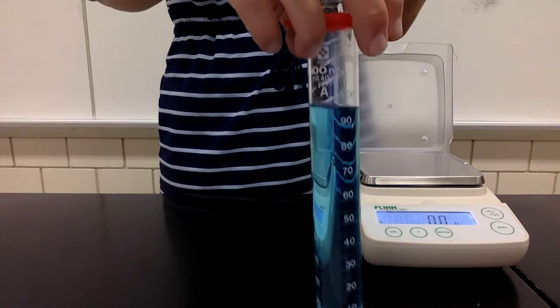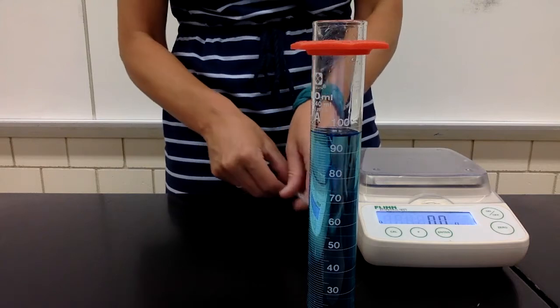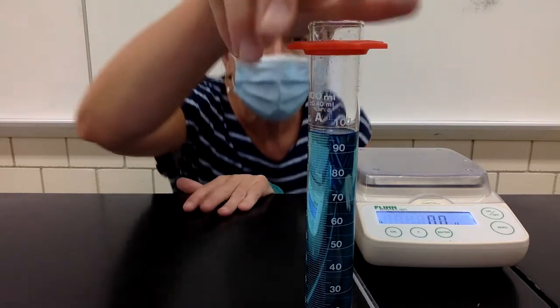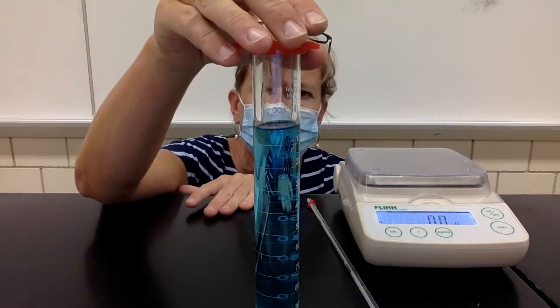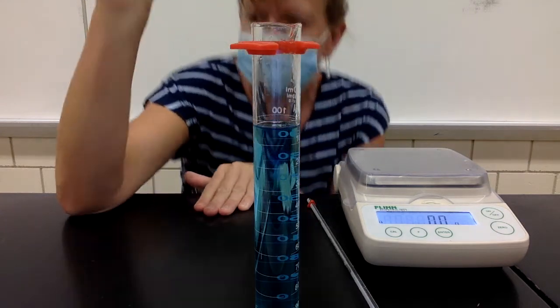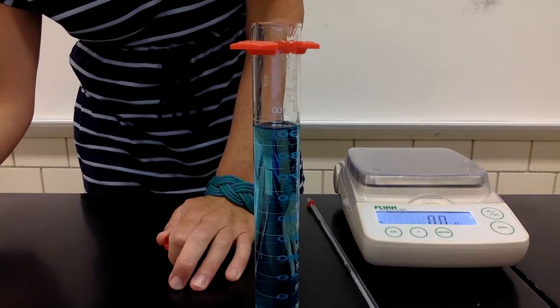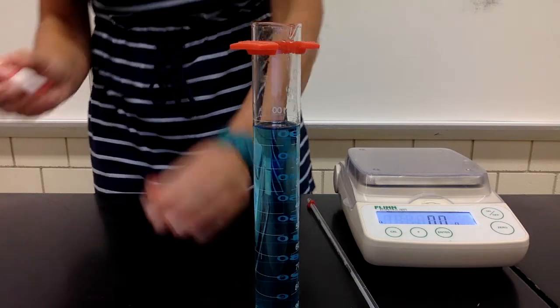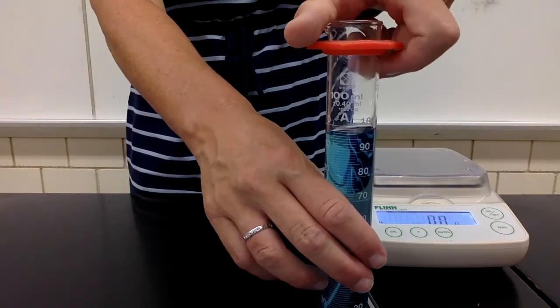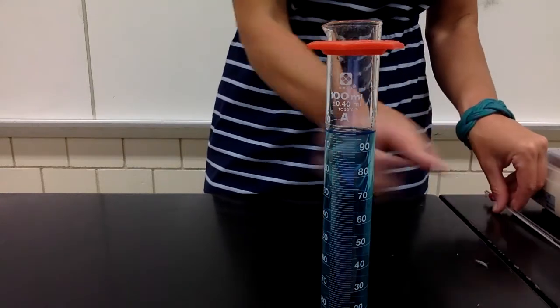And then I am going to measure the volume again, and that looks quite a bit different. If I read the volume now, wow, it looks like it's well below the 100 mark. It looks like it's about 96. So a significant drop in volume. Strange. So I'm going to show you all the data here on my little table.